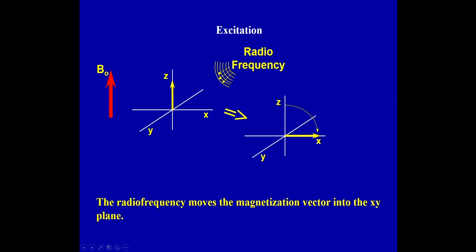I'd like to point out here that for those of you who are doing clinical studies, magnets for humans are almost always horizontal bore. So B0, even though the picture points it up, is actually horizontal for most human applications. Accordingly, this Z-axis, which is pointed up, in physical reality, this whole graph would be turned on its side. So the XY plane is actually tipped. But by convention, you will always see the graphs in this orientation. So get used to this.